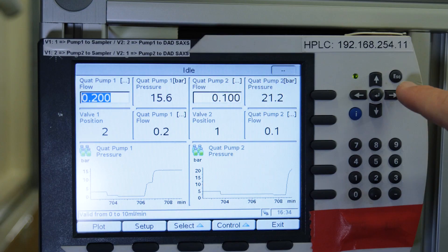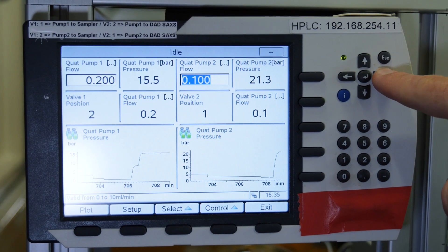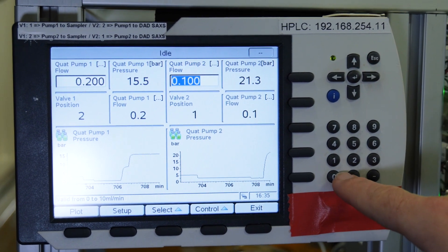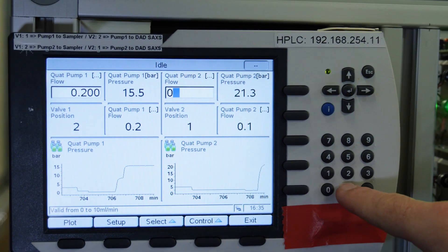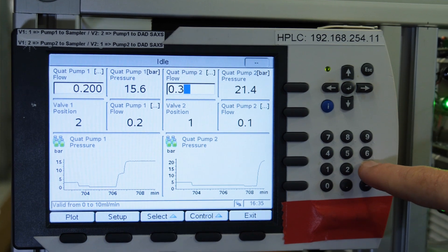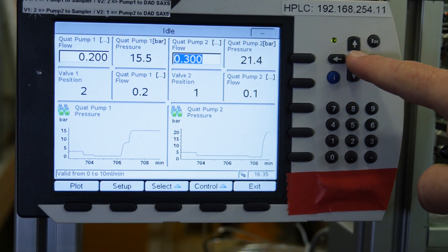Set back the flow to the desired volume. The procedure is now finished. You can prepare your samples for the SAXS data collection during the equilibration of the columns.